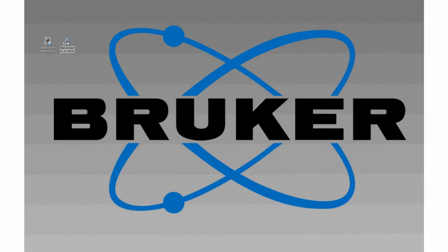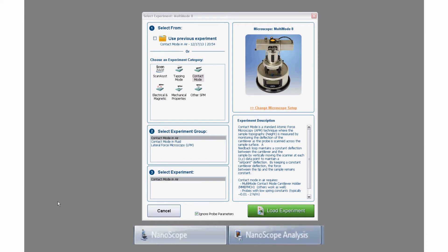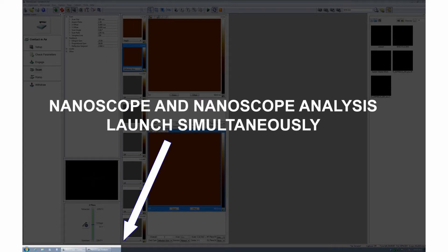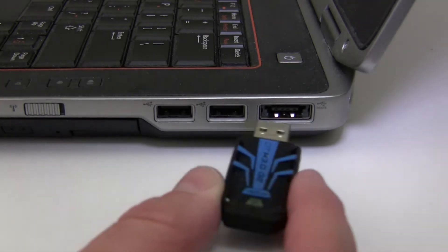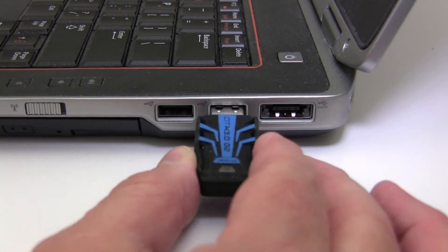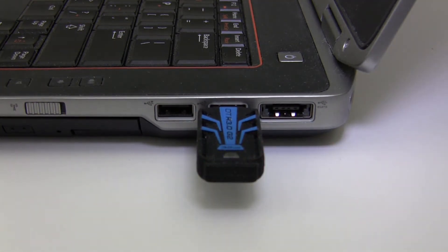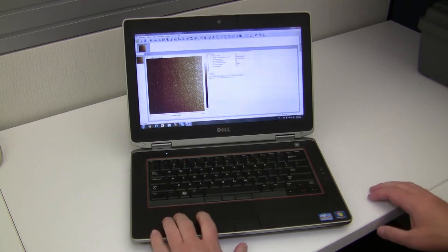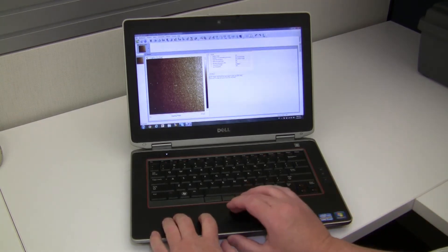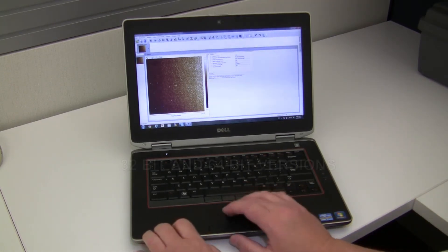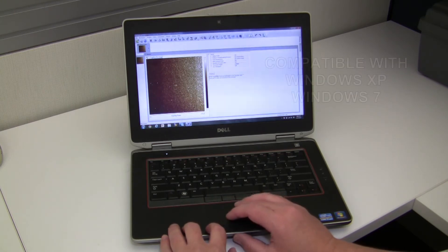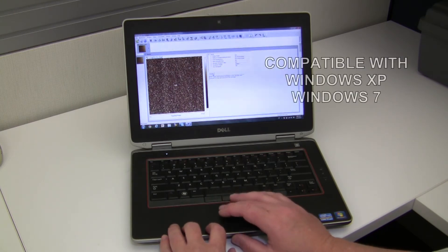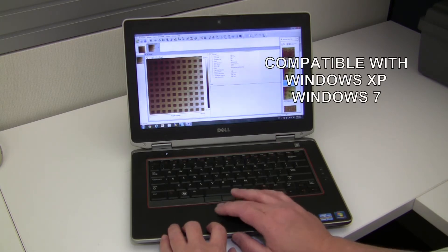Initializing the Nanoscope or NanoDrive software from the AFM workstation will simultaneously launch the Nanoscope Analysis program, which runs in the background. Images can be processed on the instrument computer or transferred to a separate computer for analysis at a later time while the instrument is offline. Nanoscope Analysis comes in a 32-bit and 64-bit version and can be run under Windows XP or Windows 7.